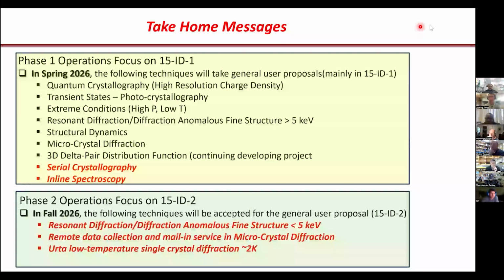Yeah, and I'm interested in sort of the other end of the spectrum, where we might be working with truly micron-sized crystals. You already talked about one of the issues, that being radiation damage. I'm sort of excited to do some work in that area. And what were your thoughts on using the area detector for acquiring some rudimentary powder diffraction data?